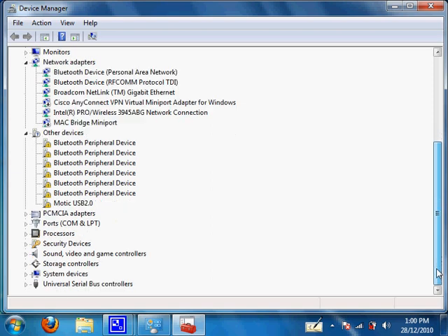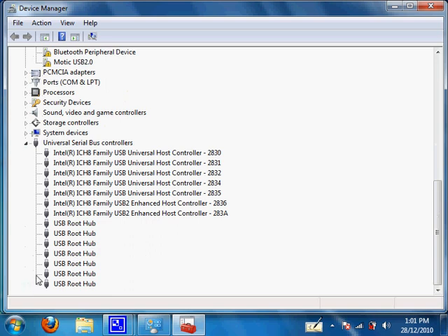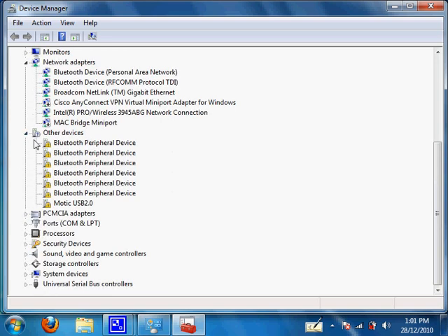For cameras with video outputs, it may show up in sound, video and game controllers. And the last one you may want to check is Universal Serial Bus Controller. Let's go inside and check for sure.